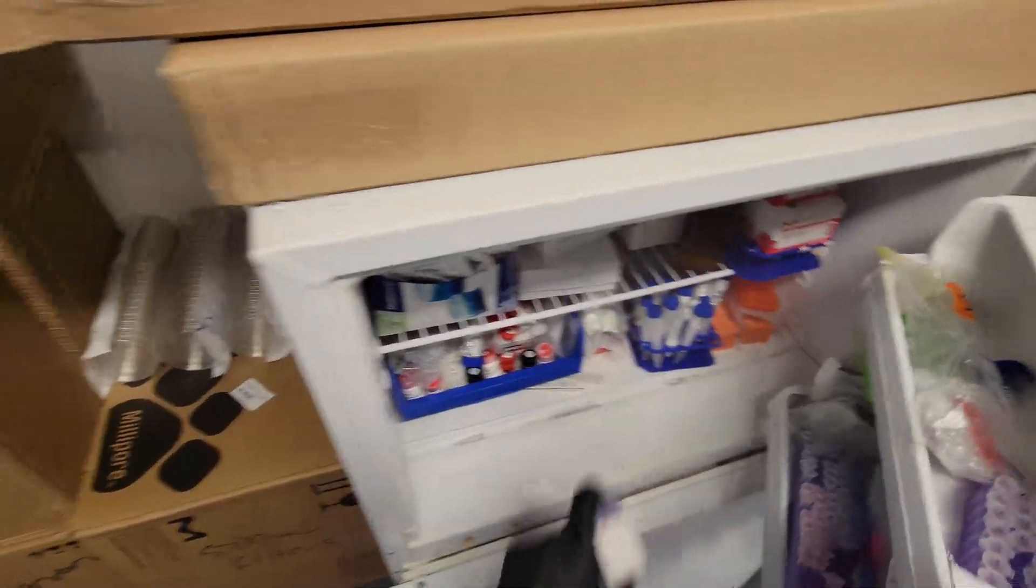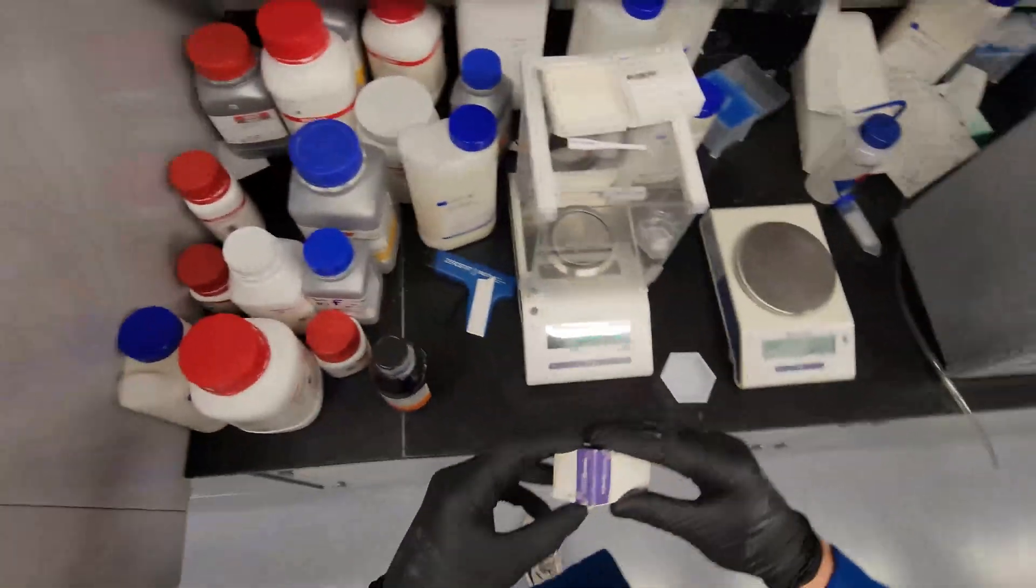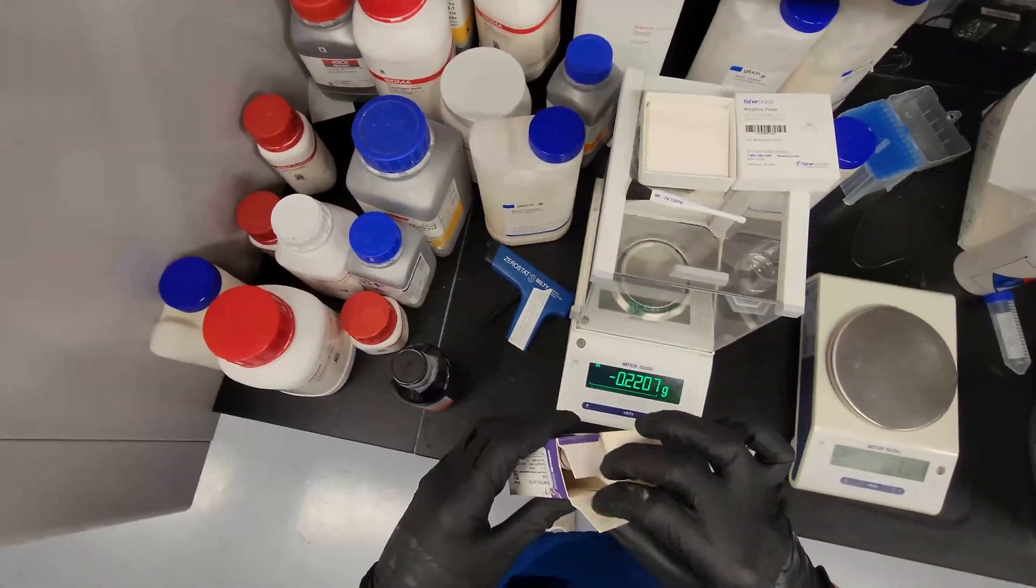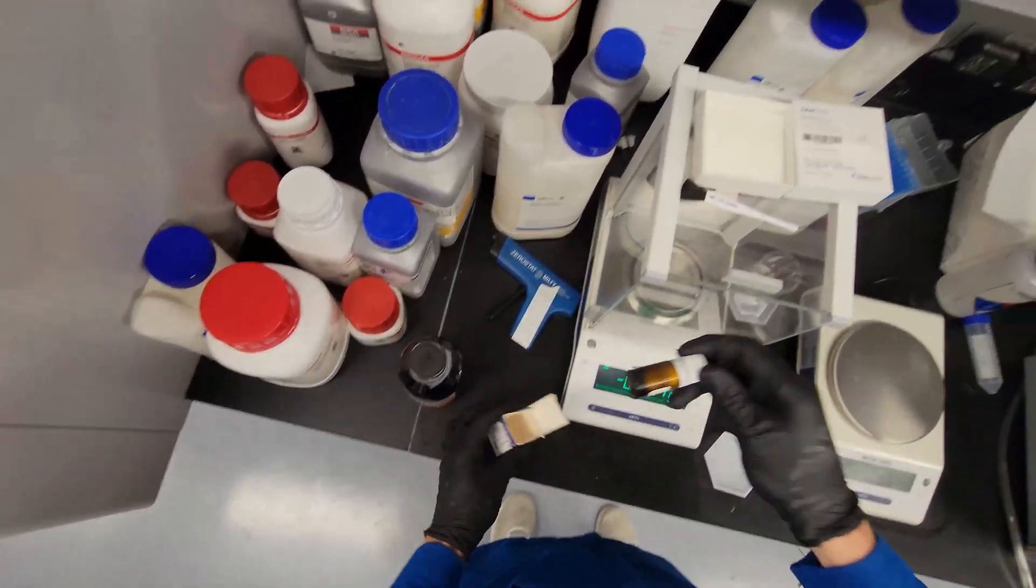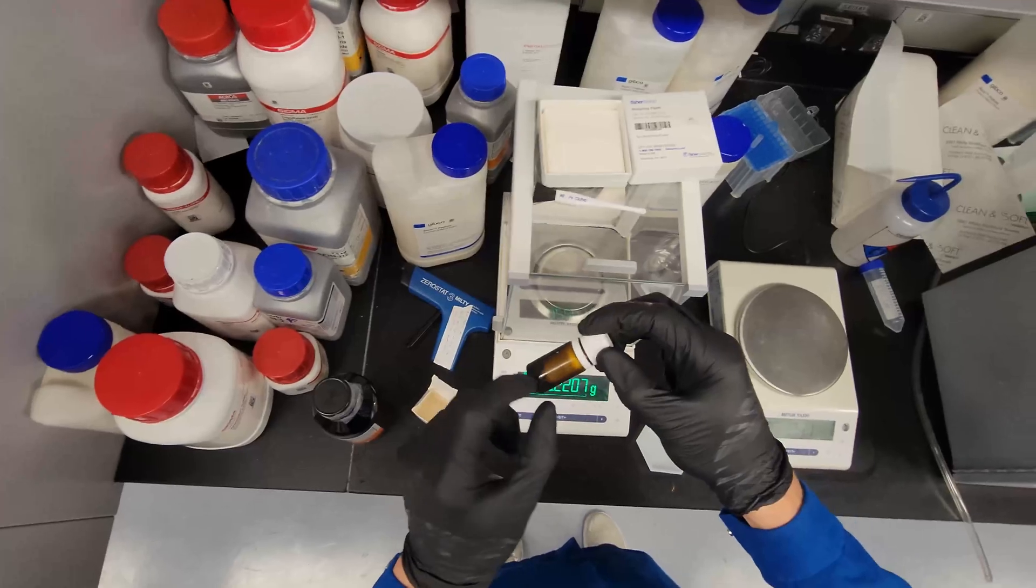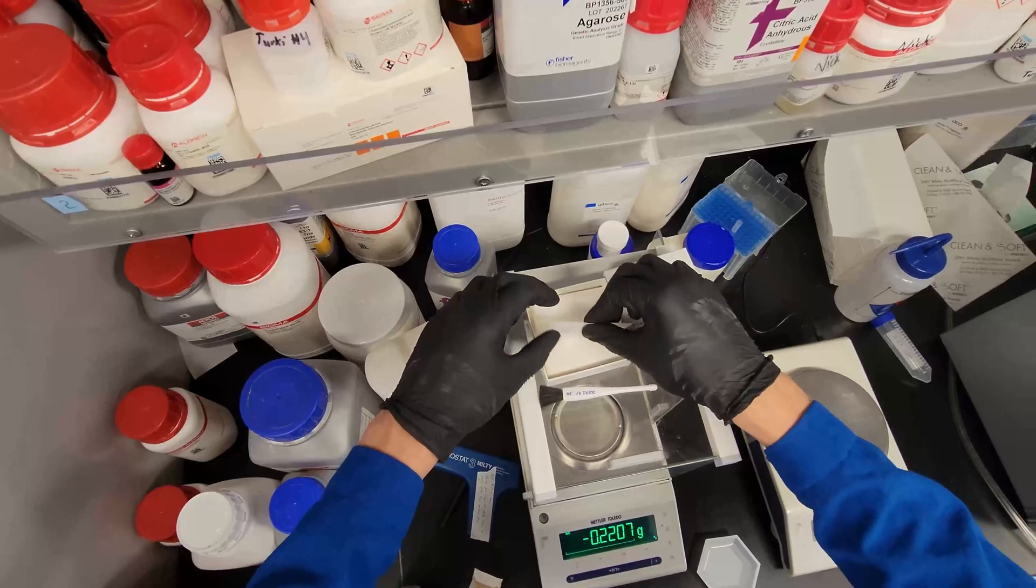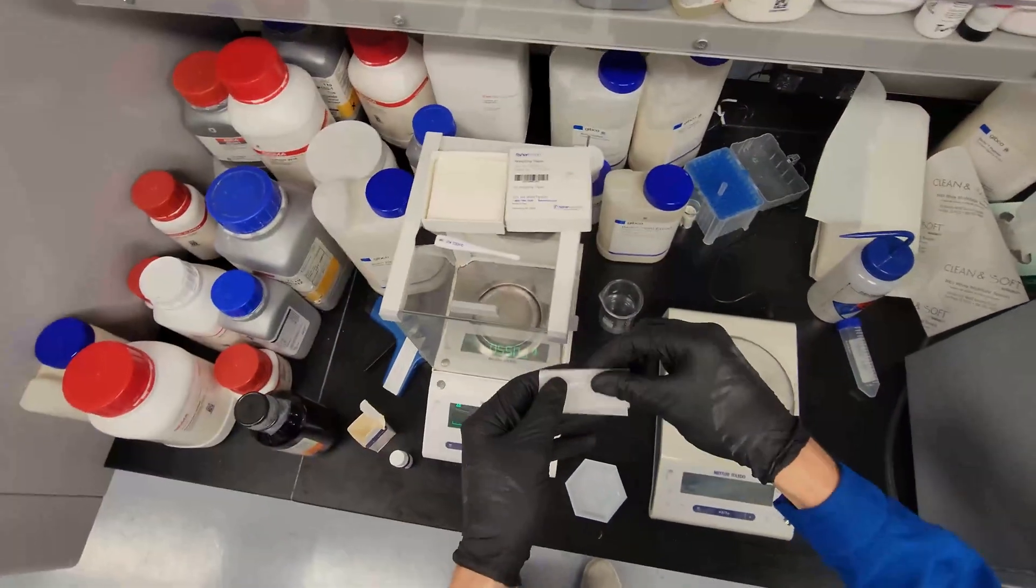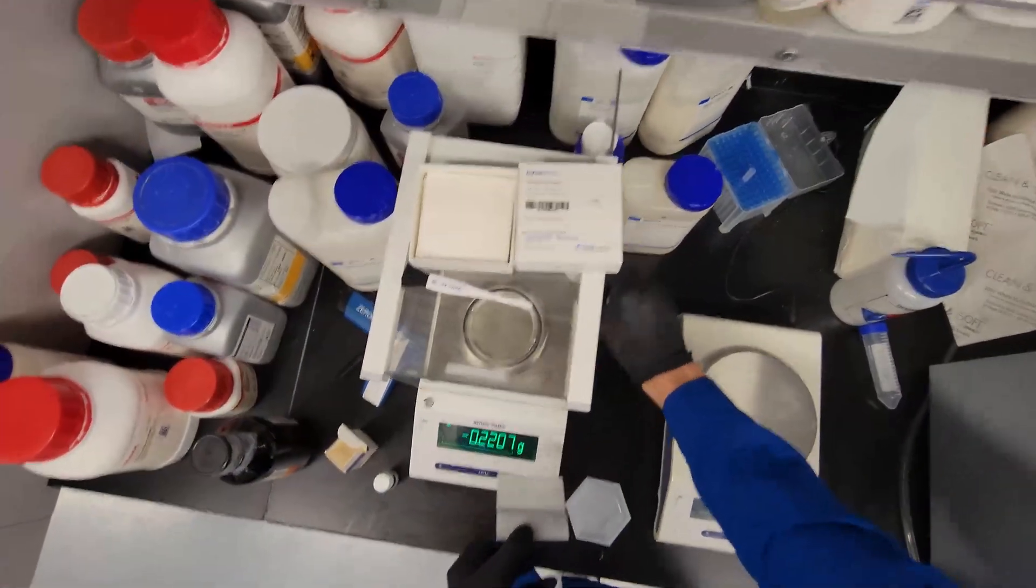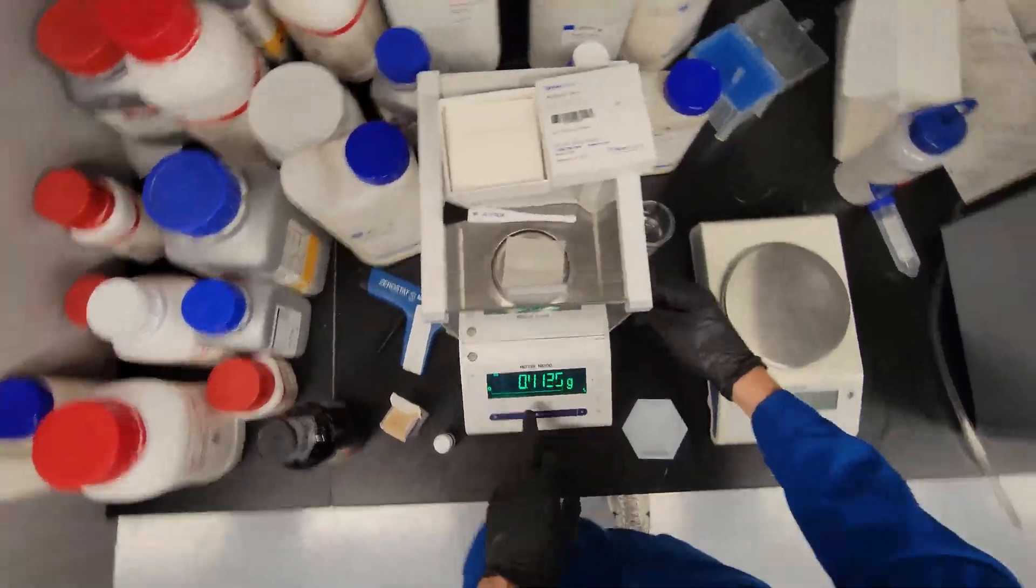50 milligrams is small. So we want to keep this cold. It's like double-walled glass, which is good for us. It's got hot hands. This is 50 milligrams. We need a tube to put this in. Let's go get a tube.